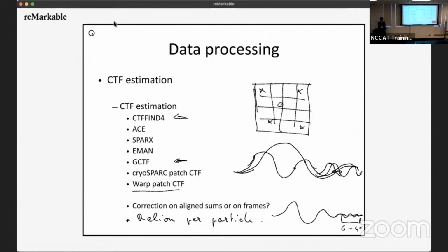And given that now we are looking at things at high resolution, maybe we don't care so much about filling the zeros at low resolution. And so if you have a few holes at low resolution, it doesn't matter. So basically, what range would be the minimum needed?